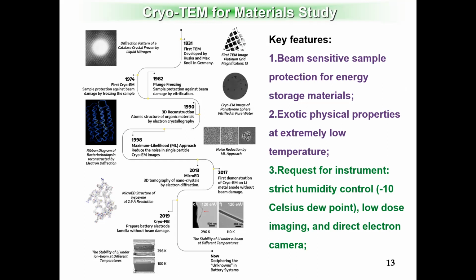Yeah. So the key graph you can check, if you know your material, is the phase diagram. Right. The reason lithium metal will be melted by the electron beam is because its melting temperature is low.